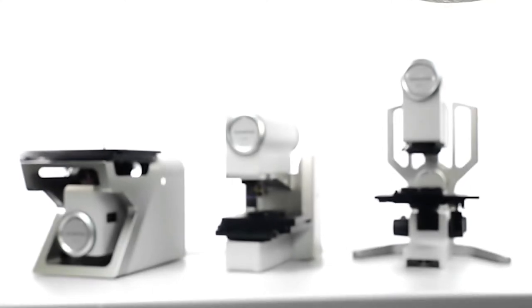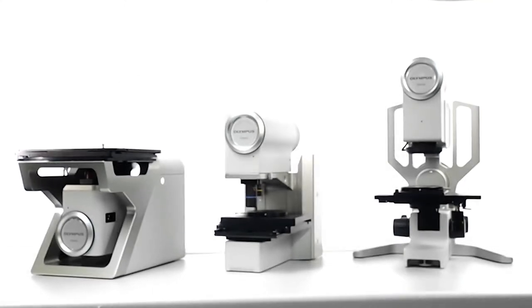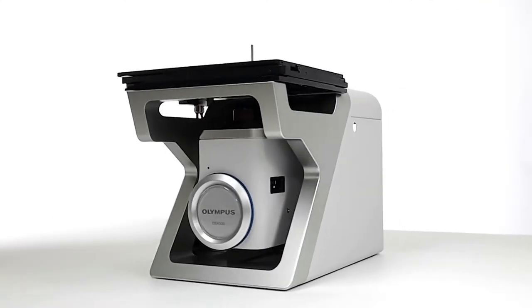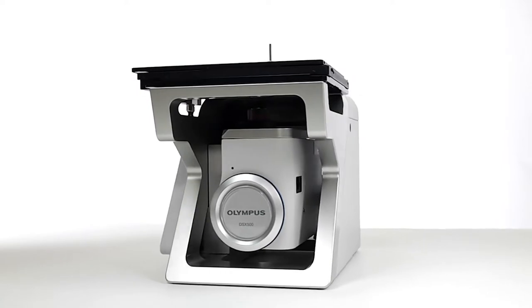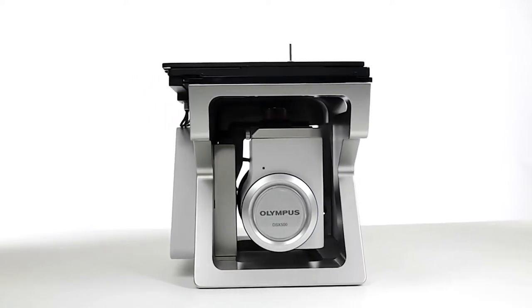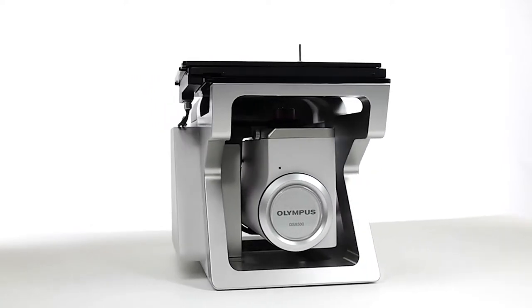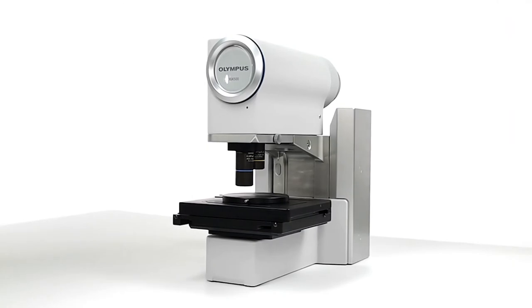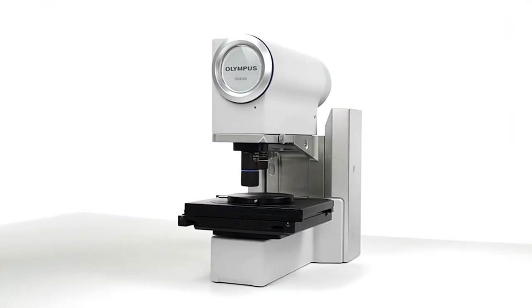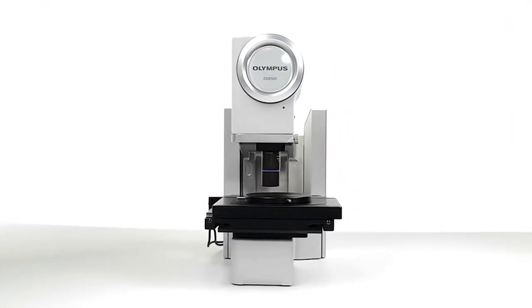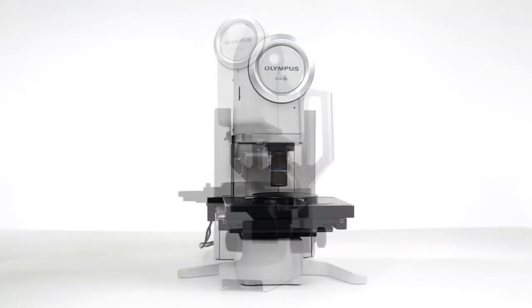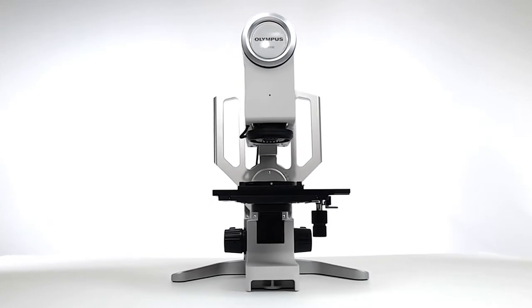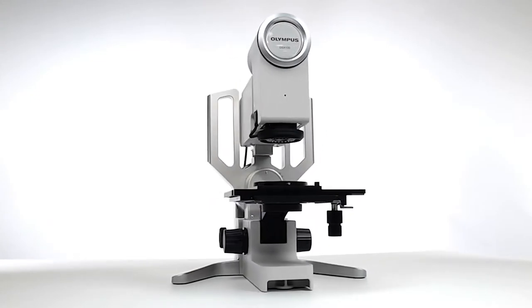Olympus DSX family of digital micro-imaging and metrology systems deliver all the advanced capabilities of Olympus' world-renowned imaging and metrology technologies, combined with advances in form and function so far-reaching that no other system even comes close.